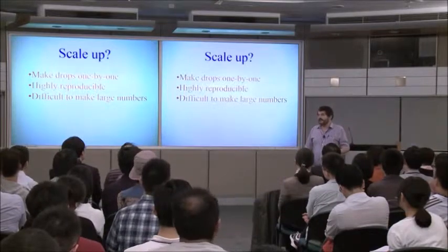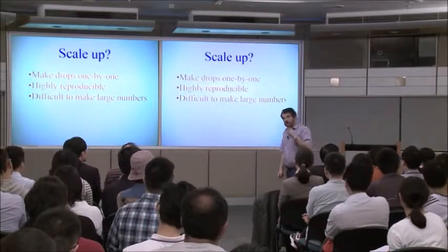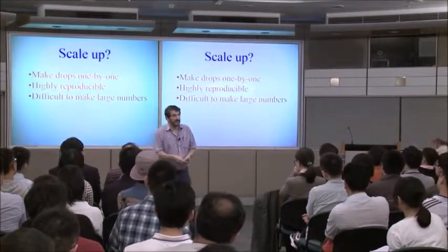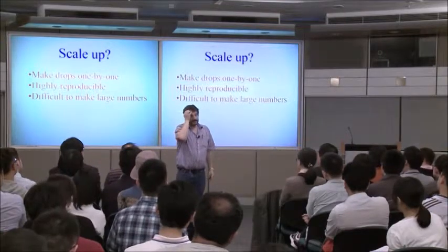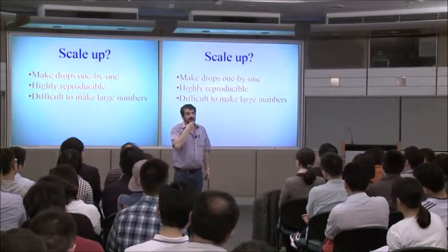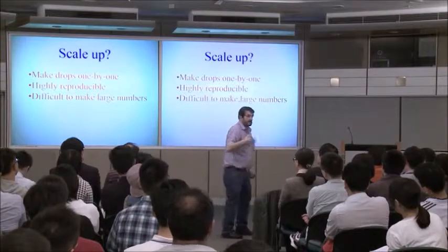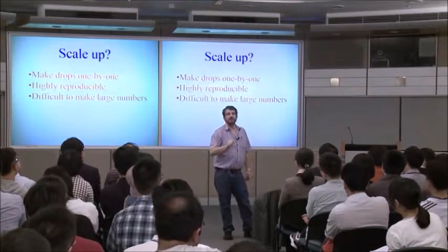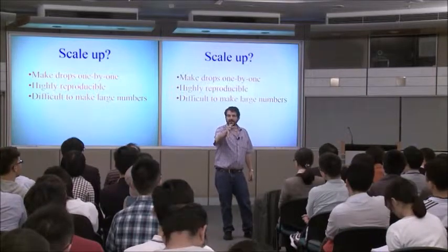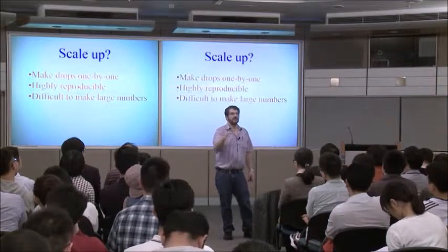And we had to ask, could we make this in sufficient quantities to be interesting? So, I always tell the story. One day, I thought about this, and, well, Anderson was there. He was such a great student. He's a great professor now. He could make these devices in half an hour. I said, well, Anderson, we have to test these things. Could you please make 2 devices, and we'll test them. We'll see whether they're uniform. We'll compare the drops, the emulsions, the double emulsions made from one to the other. We'll see if they're the same.